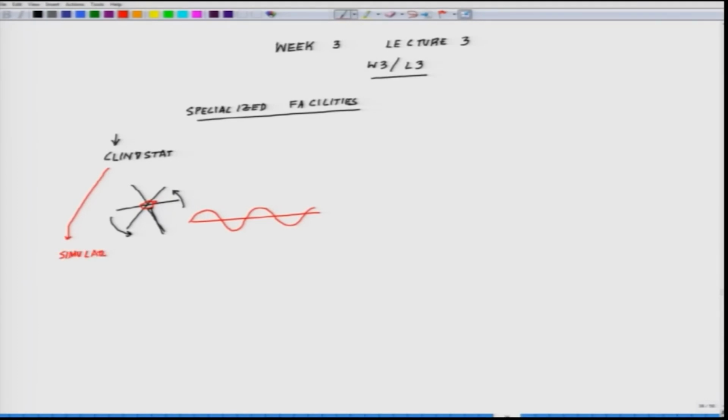simulate zero gravity, or zero gravity is really tough to simulate. It's basically a microgravity situation, how the cells grow in that kind of situation. So, you have a cell growing dish out here from which nothing will spill over. So, inside it's sealed properly with, of course, proper gaseous exchange, and it is moving in this clinostat.